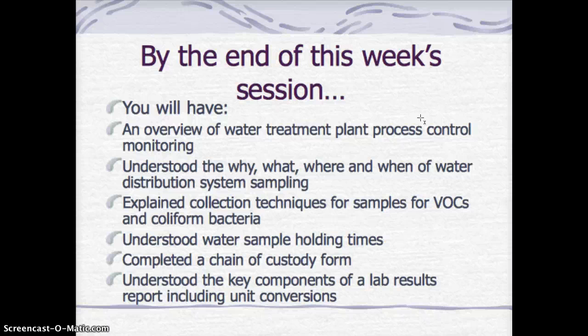You will explain collection techniques for samples for VOCs and coliform bacteria, that's volatile organic compounds. You will understand water sample holding times. You will have completed a chain of custody form and then understood the key components of lab results, including some unit conversions.